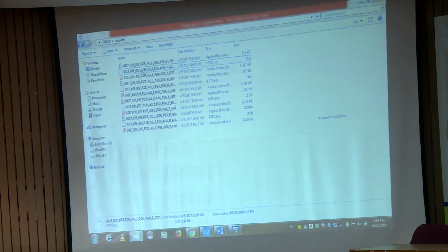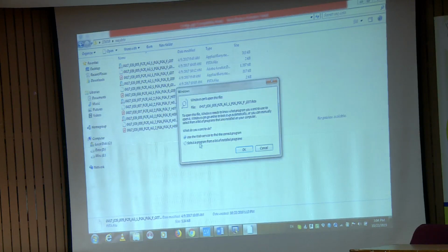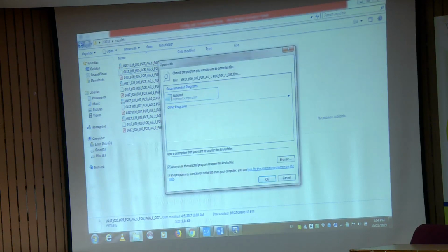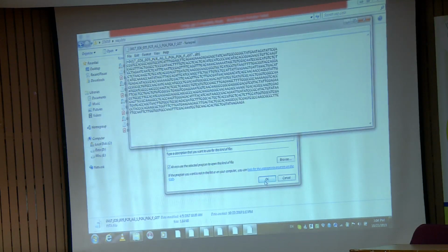FASTA file. So, this will be your FASTA file.